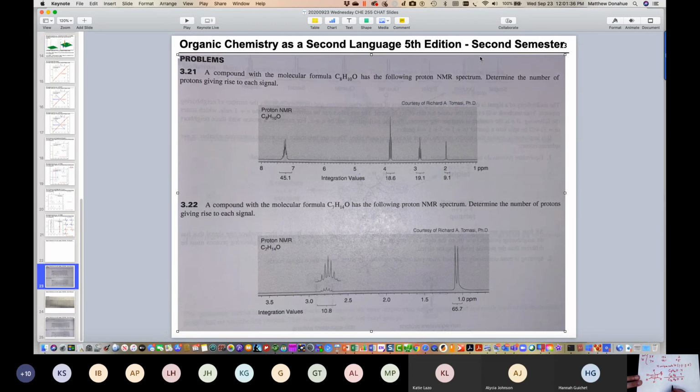So let's sort of be logical. Maybe I want to start with the oxygen. Oxygen, CH2, CH3. So Hannah says same as we did before, but add another carbon. Yeah, that's pretty much where we're going. So this only has 2 unique sets in a ratio of 2 to 3. So that can't be right.